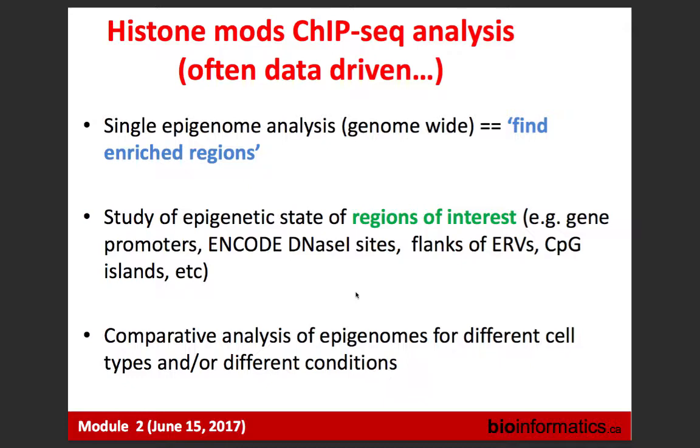And I put some possible scenarios. We have single epigenome analysis, and it could be all these six popular histone modifications which Martin introduced to you. I just showed you the screenshot. And we can ask the question, find enriched regions. In a few slides later, we will talk about what enriched regions are, because that's an interesting concept.